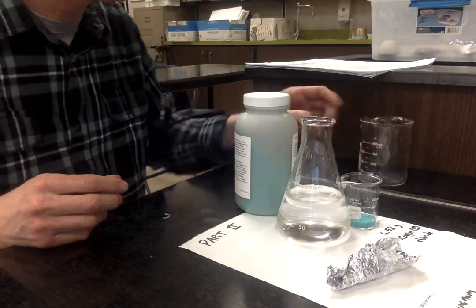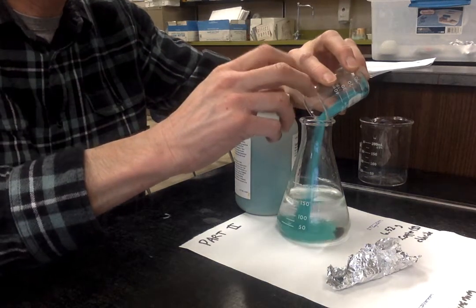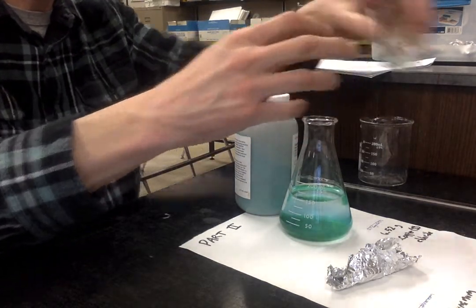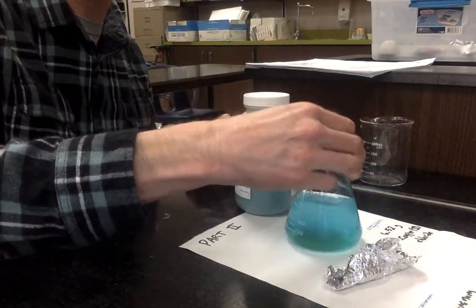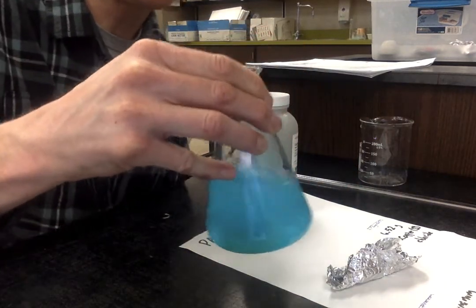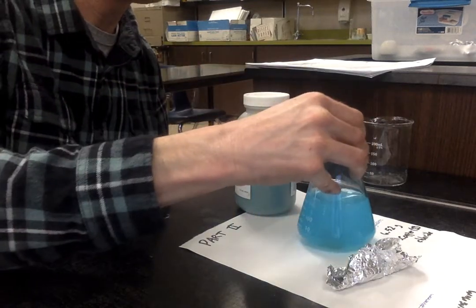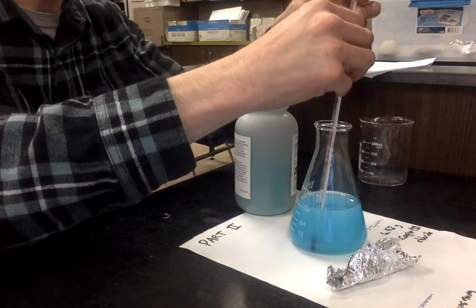And now I'm going to add my copper chloride. Carefully, I don't spill any. Copper chloride is slightly toxic. It's not very good for the environment. The good thing about an Erlenmeyer flask is it's hard to spill it. Look at this. The crystals were a kind of blue-green, and I put this into a solution. I made this very pleasantly colored solution. Color is a qualitative variable, isn't it?